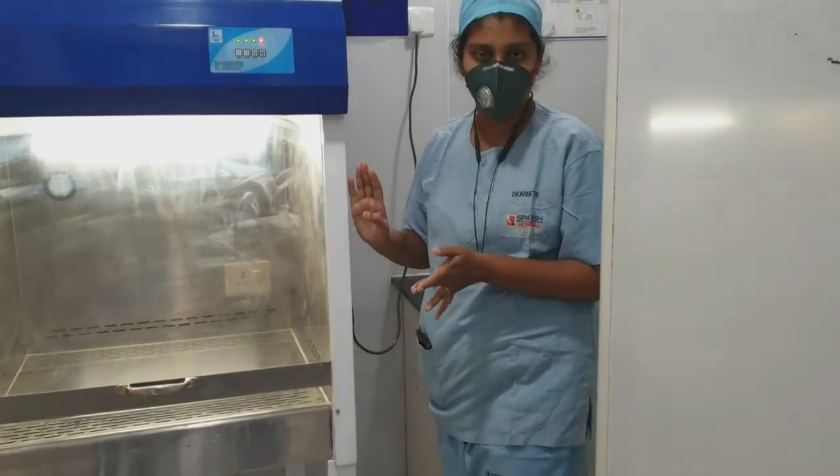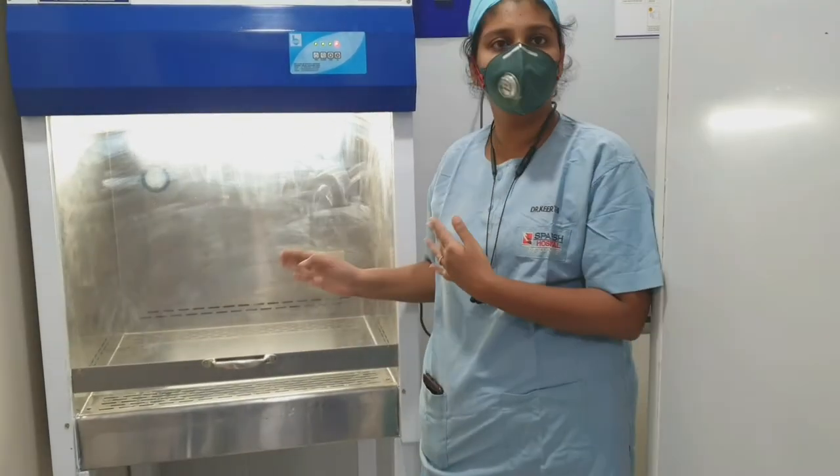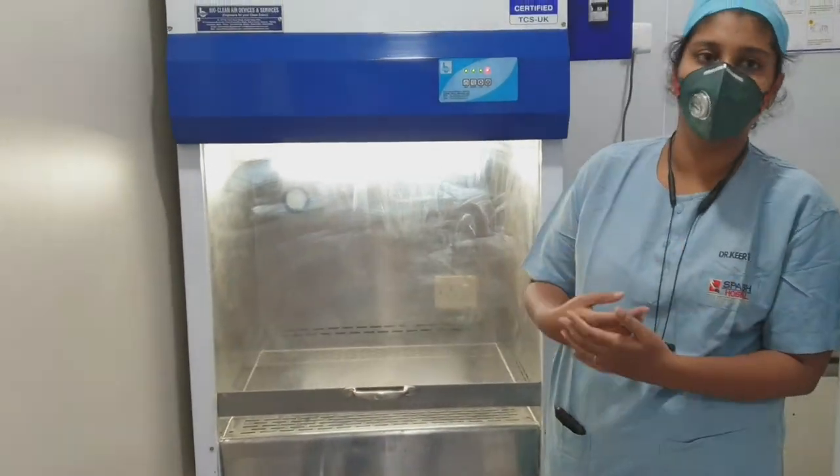So basically, this is the whole point of working in the laminar hood. We will see how to load the chemotherapy in this laminar hood now. Our sister John Mary is going to explain about the laminar hood and how to load it and show.